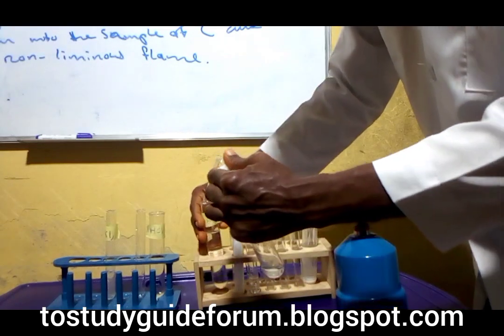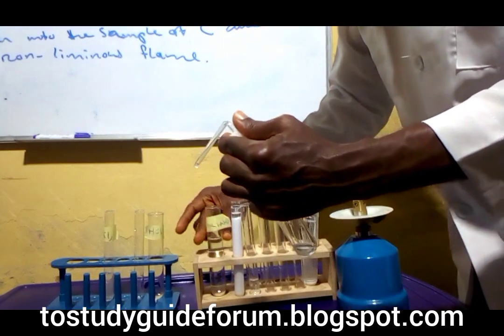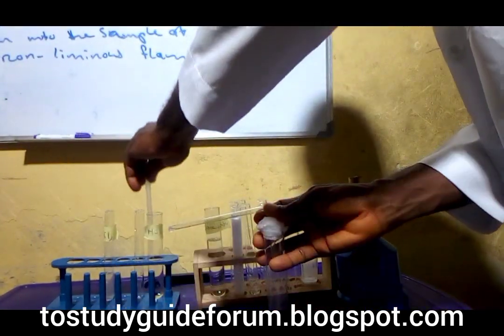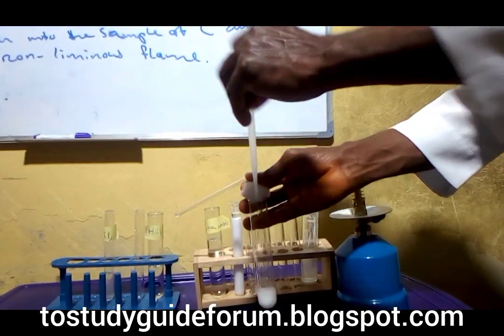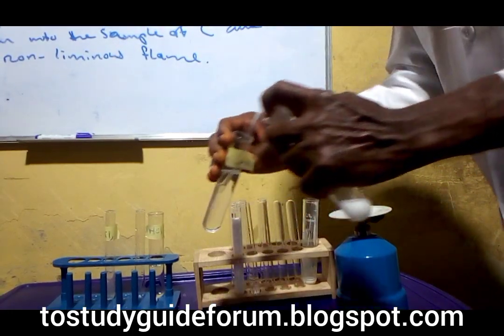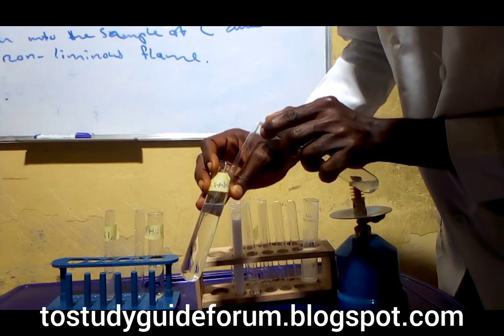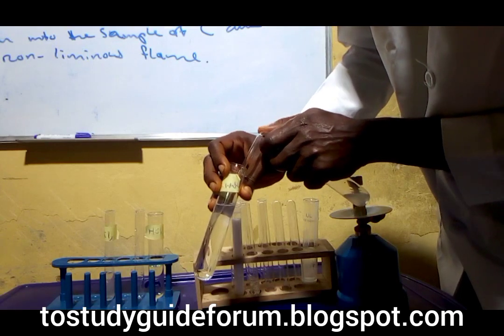Okay, it's already forming there. Notice the color coming up. Okay, a milky color is coming out a little. Let's add more acid to it and see what will happen. Now notice the milky color that is appearing at the surface. The milky color is coming out.